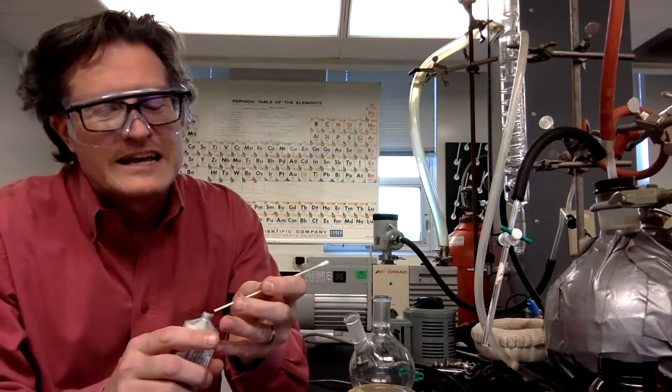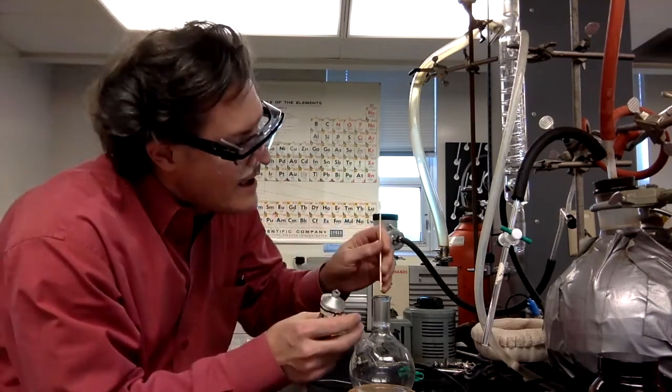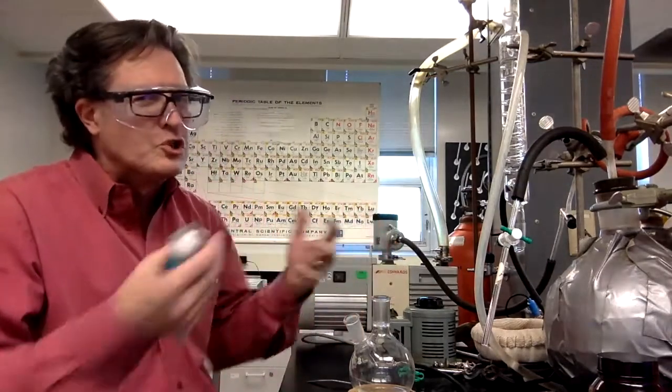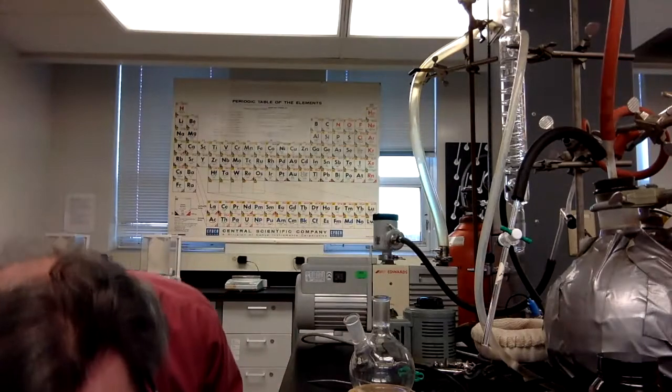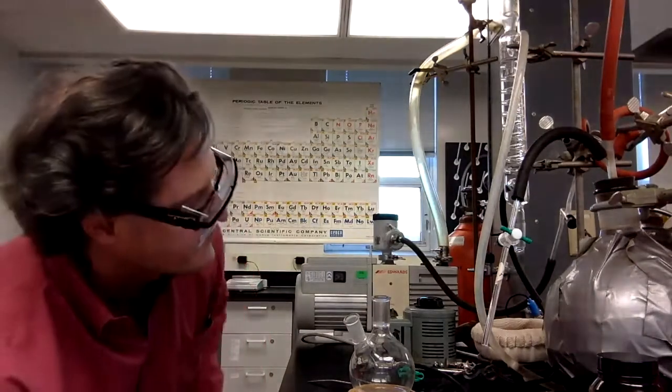So what you do is you take just a very tiny little bit, and you only need a thin film, very thin film. It shouldn't glom on there, right? It's just a thin film of vacuum grease that you need to make that seal, right? But the vacuum grease is sticky.